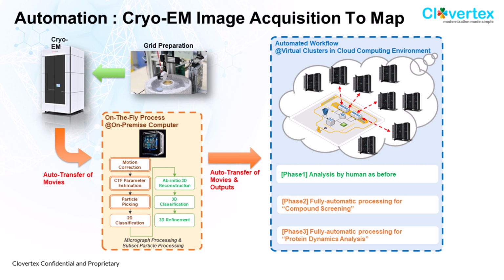And then we do more robust processing and go to the 3D domain. However, going to the 3D domain is heavy, so we do very preliminary 3D processing, but the heavier processing will be done in a virtual cluster in a cloud computing environment, such as AWS.